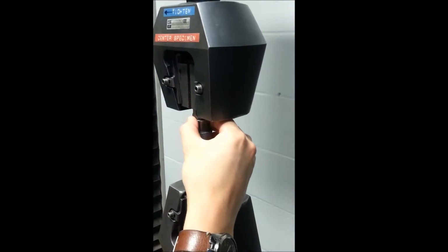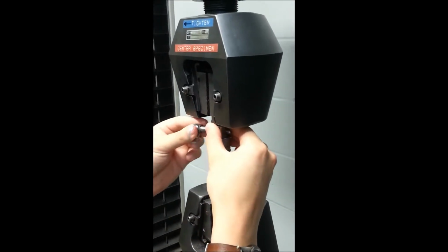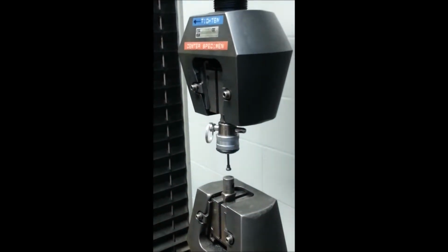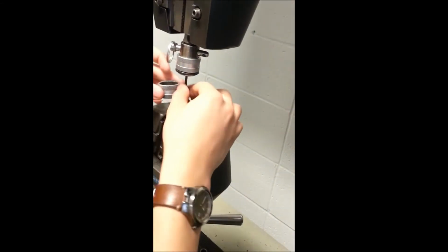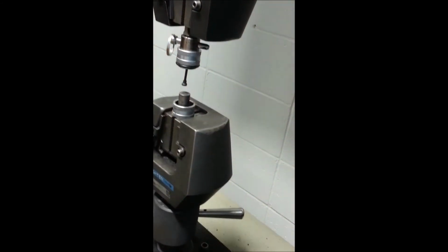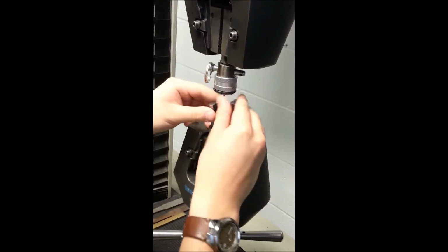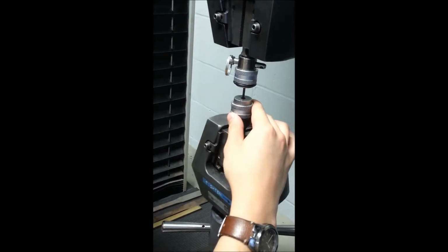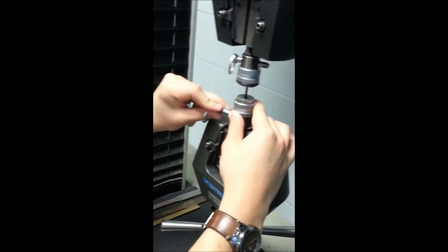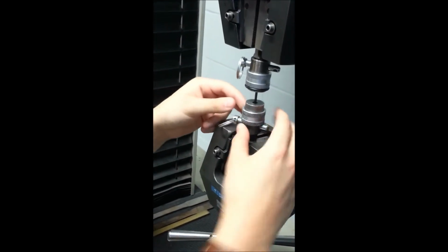After this, a secure pin was put through to hold the pieces together. The second O-ring was placed on the bottom, and 2 halves of the cylinders were placed again to hold together the bottom half of the sample. Another secure pin was used to hold this all together.